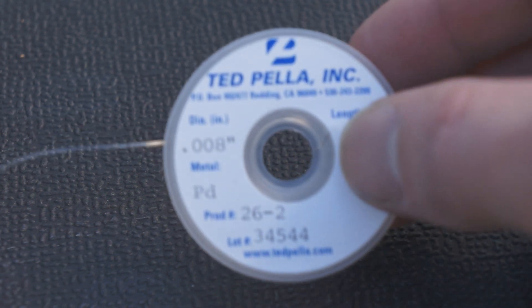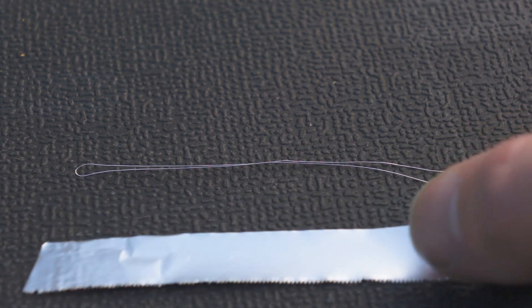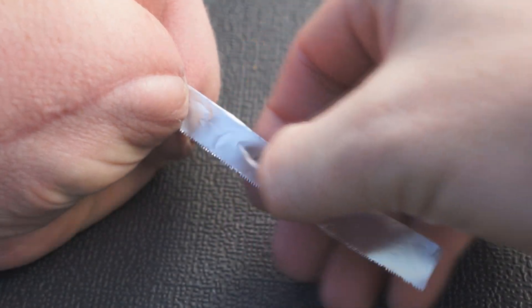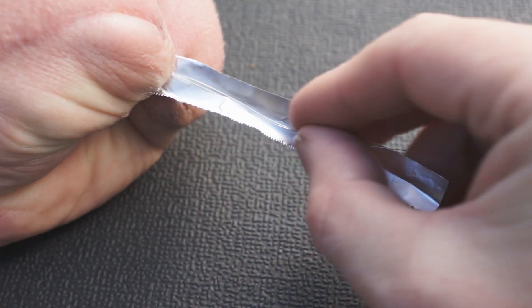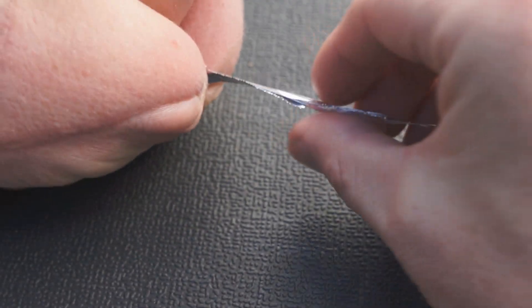This is 0.2mm, 99.995% palladium wire, and this is a strip of aluminium foil. What you need to do is wrap the aluminium foil around the palladium wire, twist it around, and make it as tight and thin as possible.